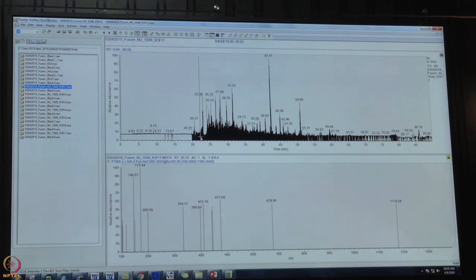If you try to compare this chromatogram to the chromatogram which was previously shown, you can very clearly see that the distribution of the peptides is not a Gaussian distribution. Also, you see that there are gaps in the chromatogram which are indicative of issues with the sample and with the electrospray ionization. So there are certain segments of the chromatogram where probably nothing entered into the mass spectrometer, or the peptides did not get ionized properly for them to be detected by the mass spectrometer.